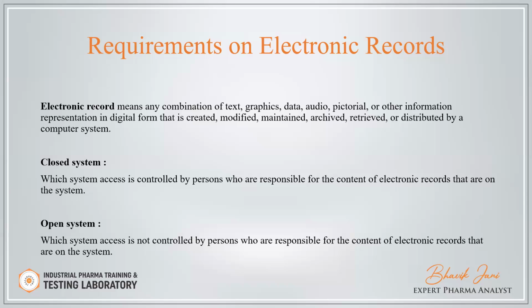Pictorial means many organizations take a photograph of the TLC plate. It also becomes an electronic record, and you have to store it as a CGMP document. Likewise, during an investigation, if we find anything and take a photograph, those photographs should also be stored as an electronic record.